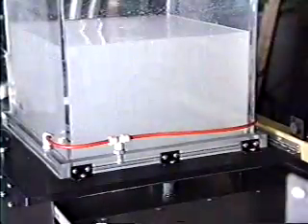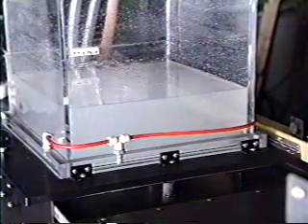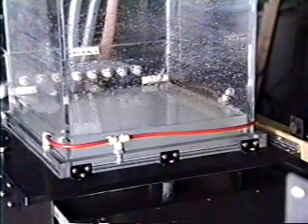After stock addition, the stock is agitated by large bubble action. The stock then settles and drains, forming the sheet on the wire in the base of the forming tank.